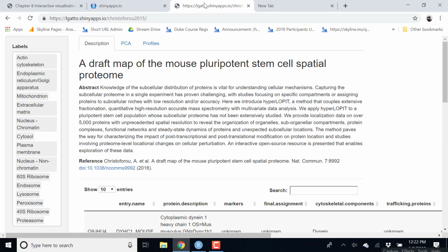So in terms of publication requirements, is there any difference between one and the other in terms of journal publications? Journals don't have any expectations. That's something that we wanted to do because it's an efficient way to share our data. In addition to sharing the actual data, sharing an interface to the data. And it actually proves super useful, to just display an application without having to run it.